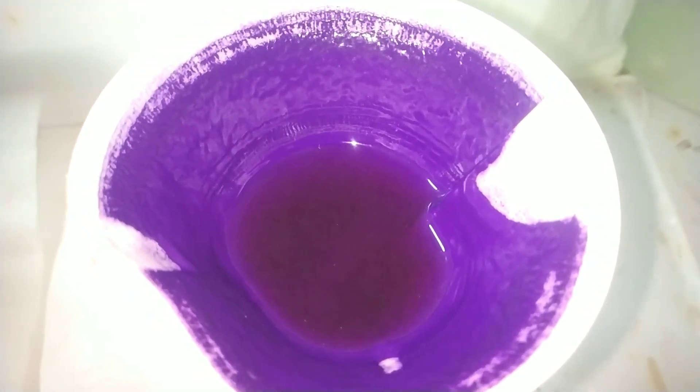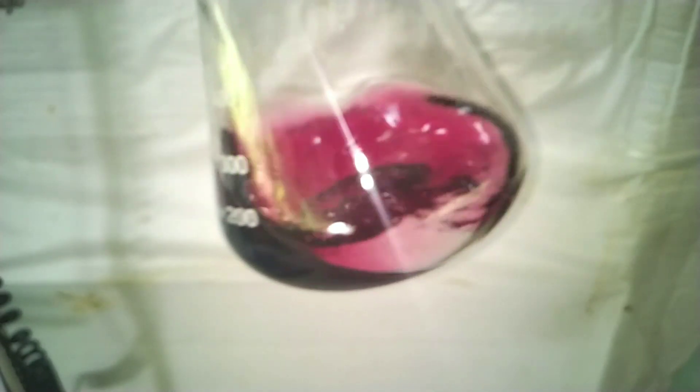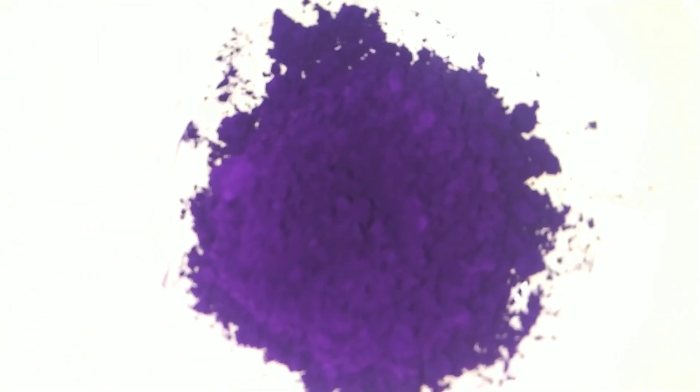In the filter paper we are left with this purple colored precipitate, and the filtrate is having a pink color resembling that of permanganate ions. The filtrate can be discarded. The product was then dried and weighed.